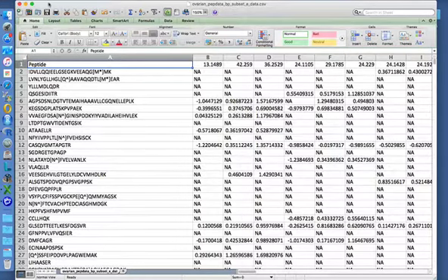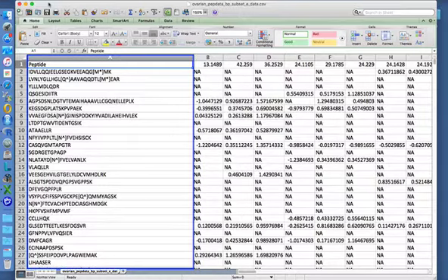This is the expression data file. This particular file gives peptide information and contains quantified data for each biomolecule, the rows, and each sample, the columns. The first row in this file is the header and contains names for each column. One of the columns must contain the unique biomolecule identifiers. In our case, we are uploading peptide data, and the name of our identifier column is peptide, column A.